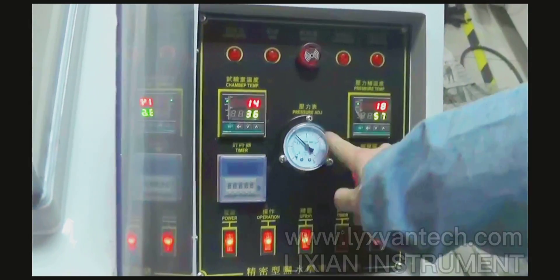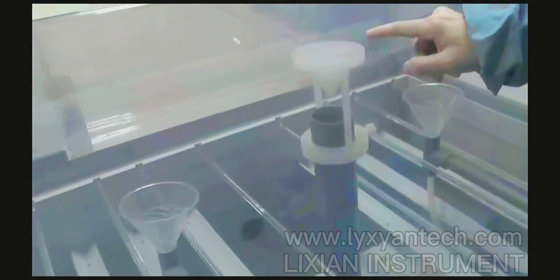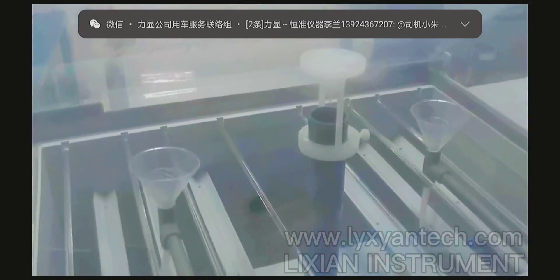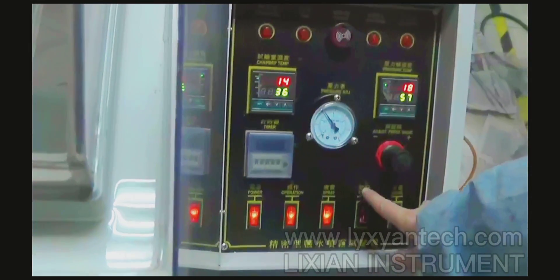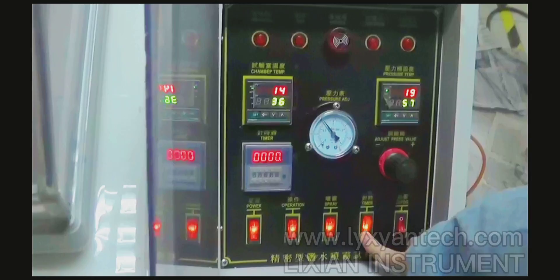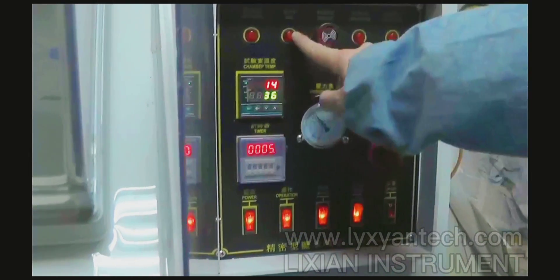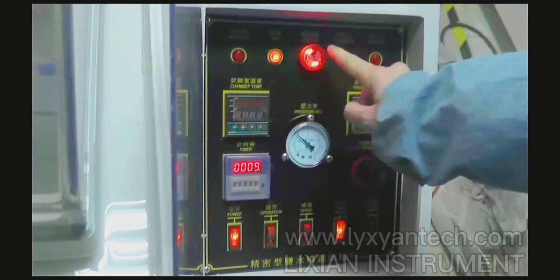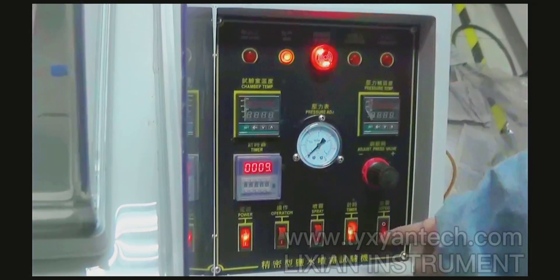After the setting, we connect this one to the power supply. Now we can see it is supplying the salt water. We can set this one, and then we need to open the timer to begin the countdown. We see on here it has finished, and that means the testing has finished.